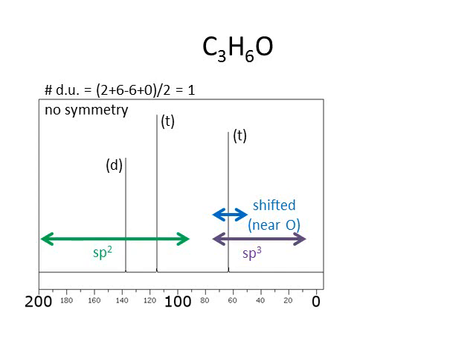What else do we see? We have information from the off-resonance decoupled carbon-13 spectrum. That is, we know that in the ORD, the signal around 138 or so is a doublet. CHs give doublets. We know that the carbon that gives a signal somewhere around 115 is a triplet. CH2s give triplets. And we know that the carbon that gives a signal around 62-ish is a triplet. That's a CH2.